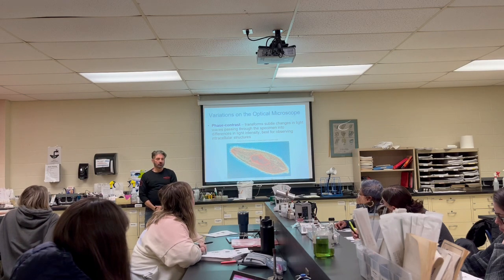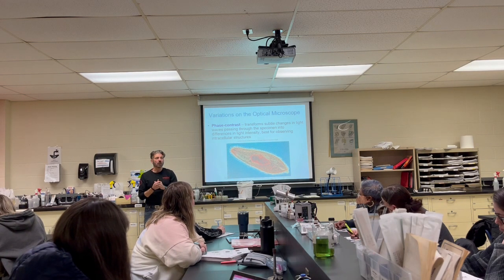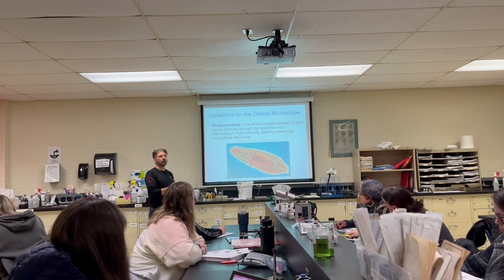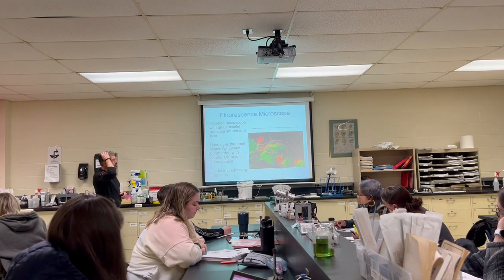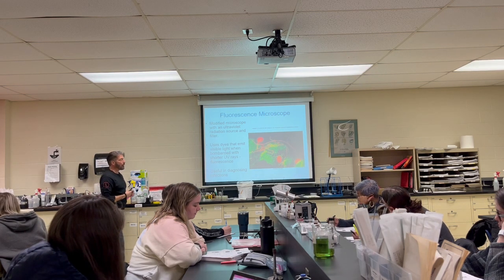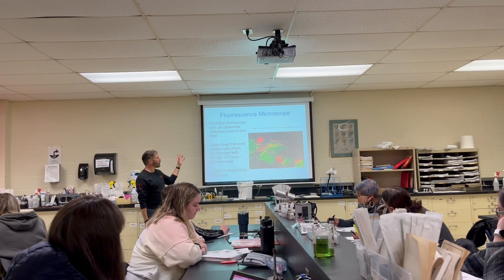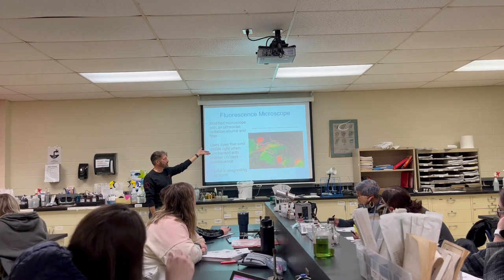They don't have organelles, so you're only going to see the basic outline shape of it. You can't really see the inside. You can't see any of the things inside the bacteria, ribosomes or anything like that. With a fluorescent microscope, you'll see a lot of pictures of this in Tortora or Bauman, showing how we can use dyes to really let us see that.